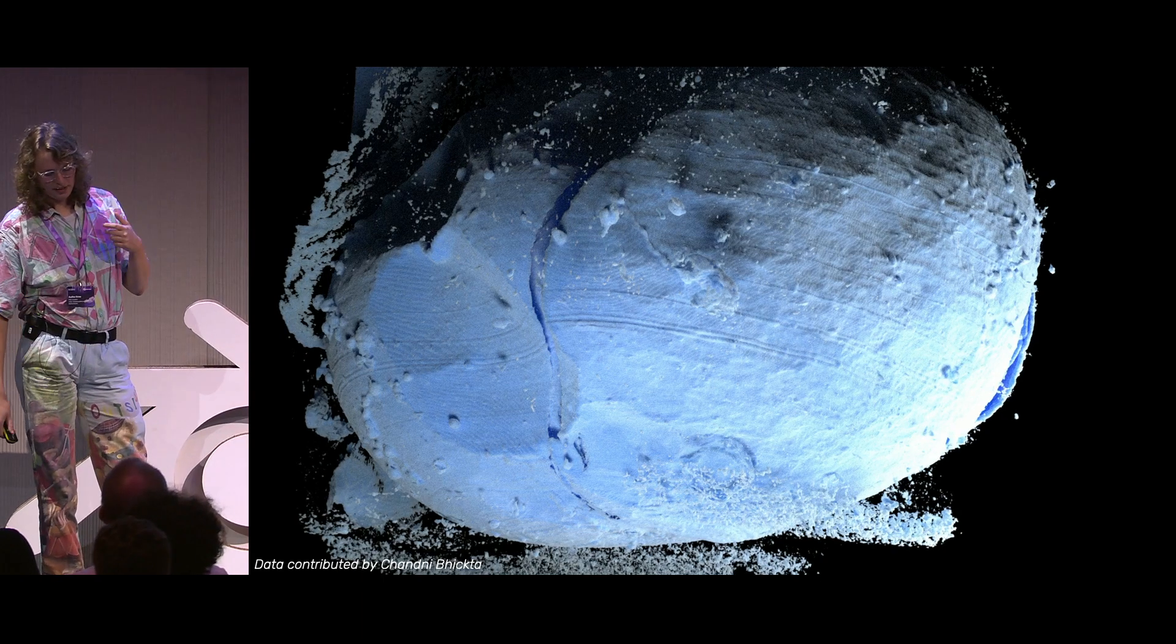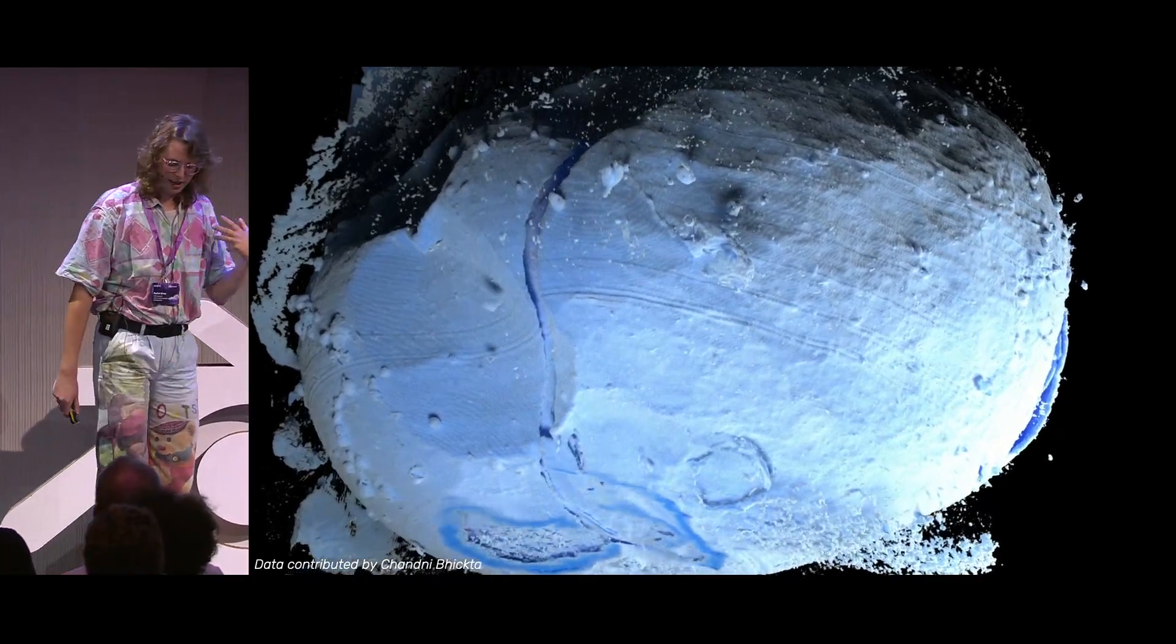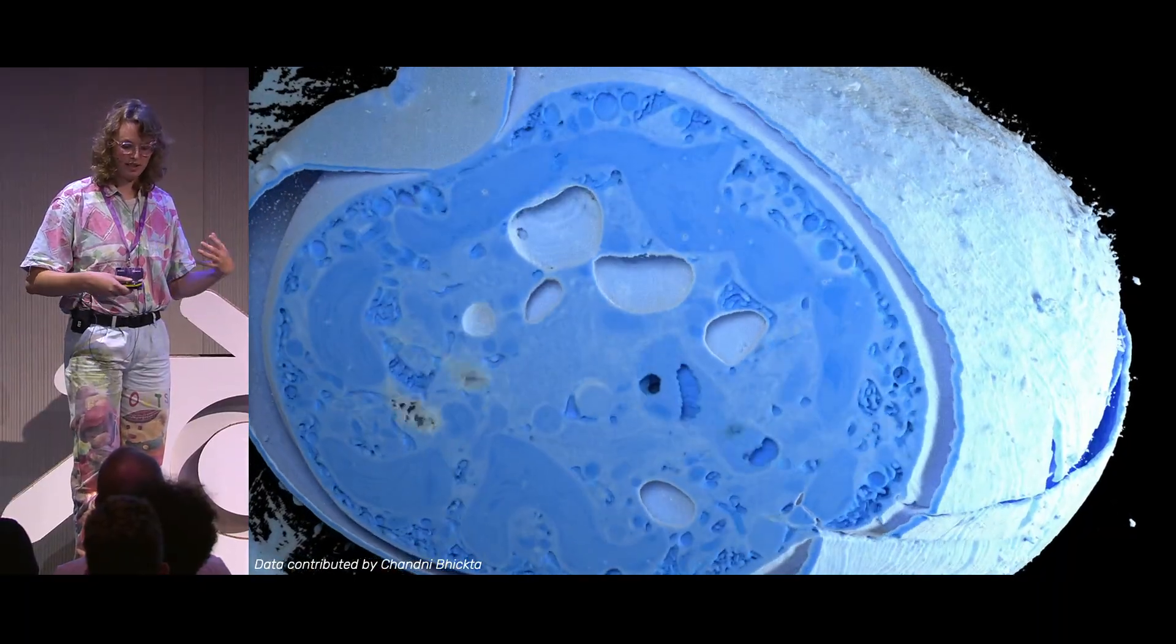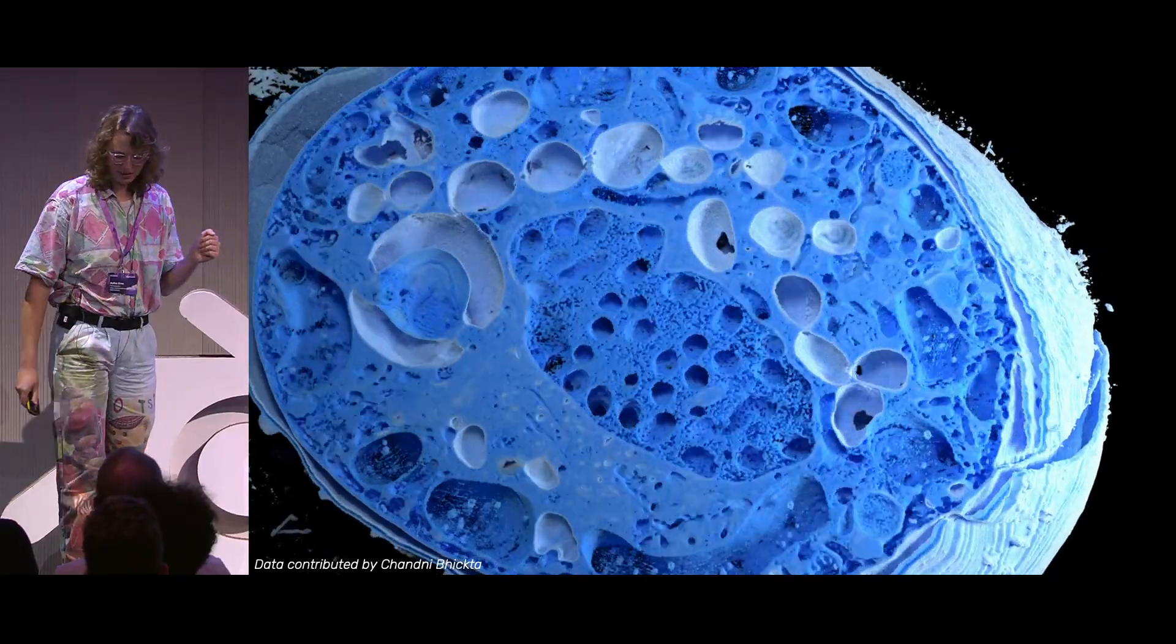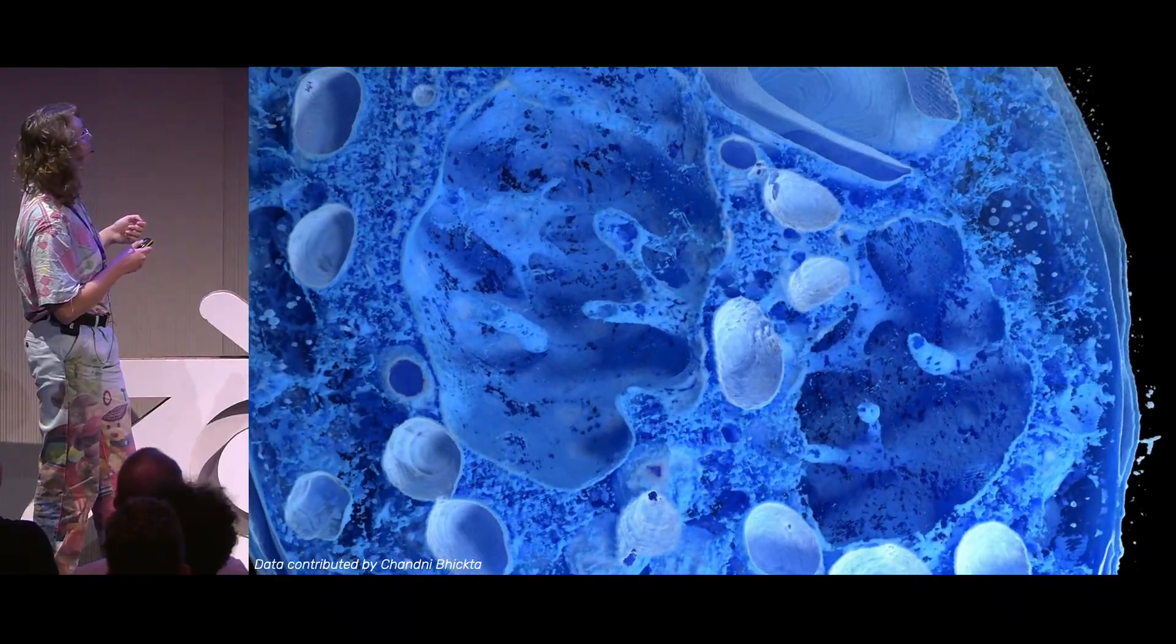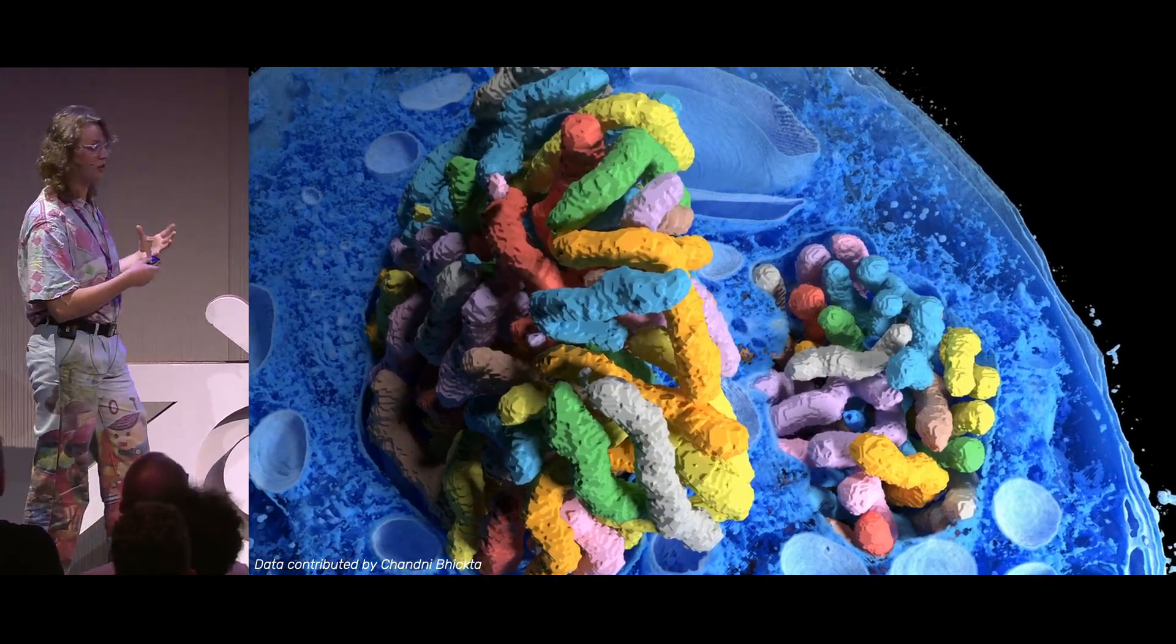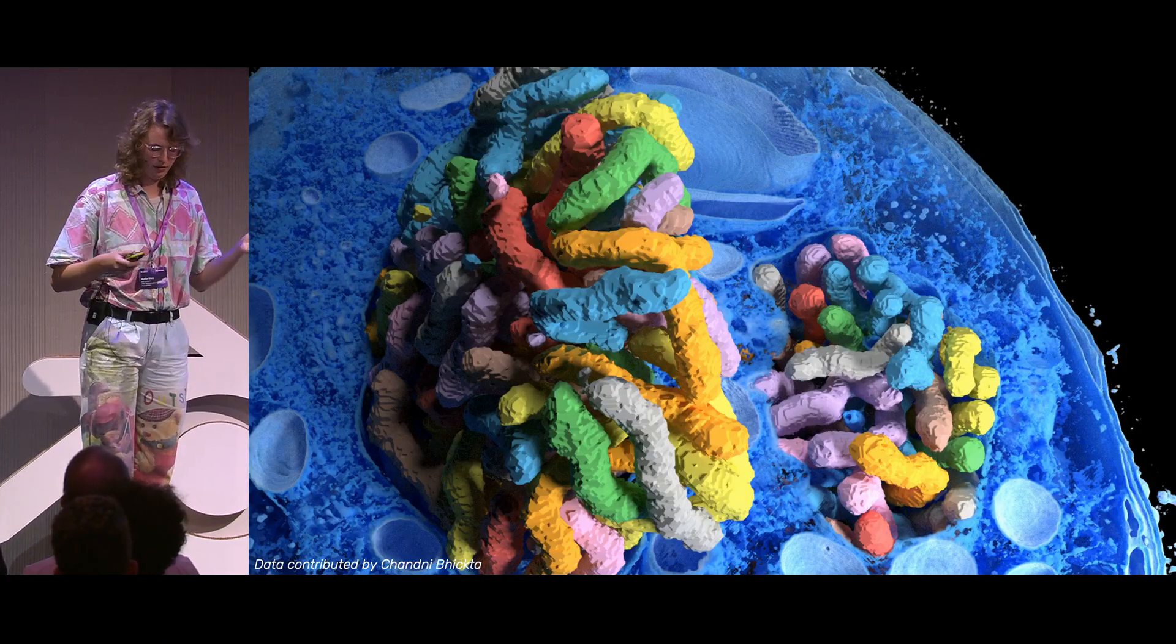And what we can do is we can start to go into this. And then this will reveal that this is actually a dividing cell, so it's actually going through mitosis. And this is the first time this species has been seen dividing in the wild ever. So that's really cool. So here we're seeing the first nucleus, and here the second nucleus that is dividing. And we can actually see the chromosomes, so these were annotated in a separate program, but then loaded as meshes into microscopy nodes using the label mask loader.